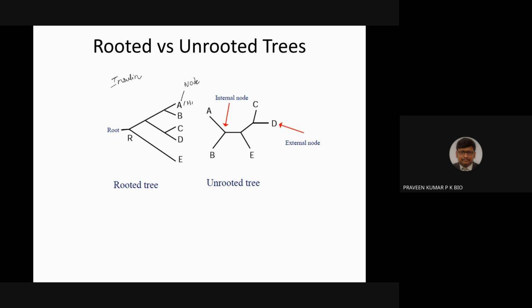So in our example, whatever we worked on, we got human and gorilla linked with each other in the insulin protein, and chimpanzee, that is Pan troglodytes. And the bonobo and macaque monkey also resemble similarly. That is, chimp, macaque monkeys and gibbon monkeys have close proximities. And you can find another one like Bos taurus. Bos taurus is an ox, so it has a distant relationship.